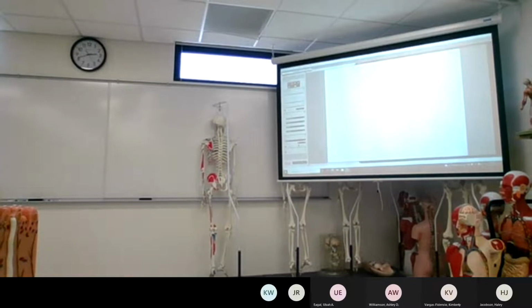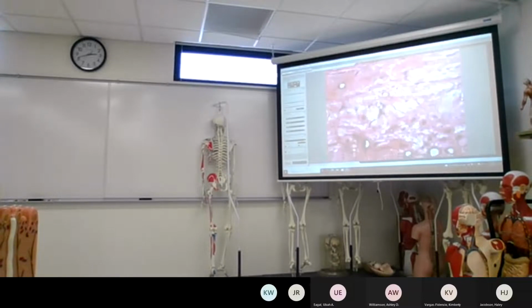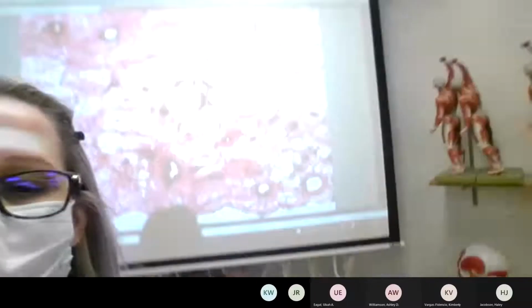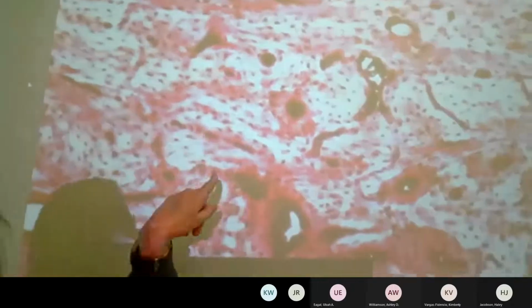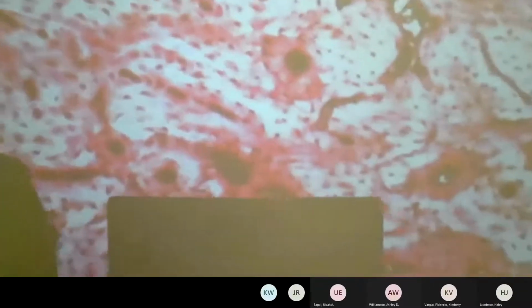All right. Next, keeping in our connective tissues should be bone. Bone is pretty easy to tell what it is. Okay, so with bone, you're going to have a lot of solid material. If it's compact bone like this, you want to see a lot of these tree trunks pointing up at you. The tree trunks with the concentric rings are telling you it's osteons, and the very center should be some blood vessels running through.